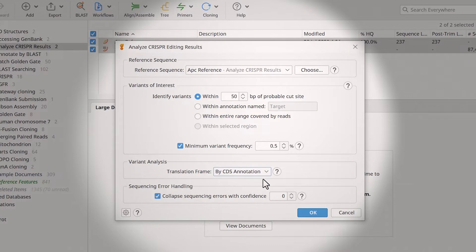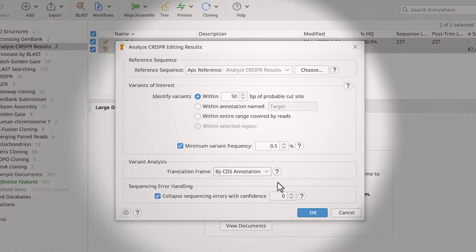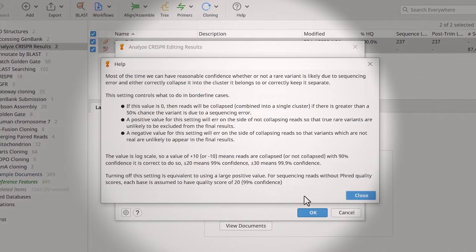Finally, you can adjust how Geneious handles sequencing errors. For example, when using a value of 0, the reads will combine into a single cluster known as collapsed if there is a greater than 50% chance that the variant is due to a sequencing error. To learn more, open the Help window.